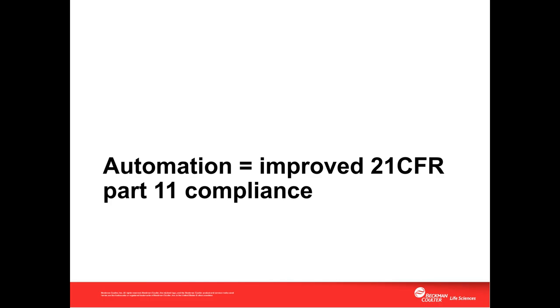Now, as I mentioned a few moments ago, in their 2018 questions and answers documents on 21 CFR Part 11 data integrity, the FDA voiced their concern that they were increasingly observing GMP violations involving data integrity during their inspections. They indicated that whilst the security of the final electronic record is important and it should be protected against adulteration, it's not the only focus of 21 CFR Part 11, but also that the electronic record contains accurate data too.